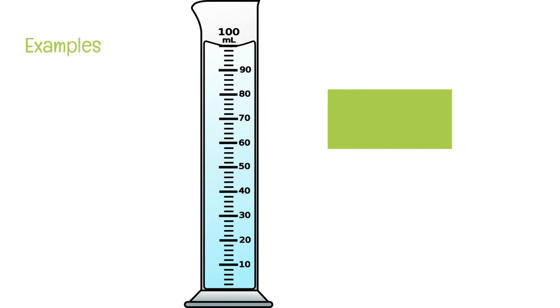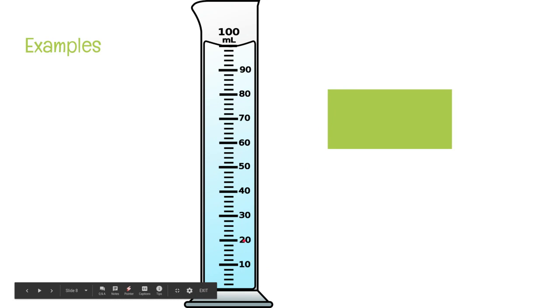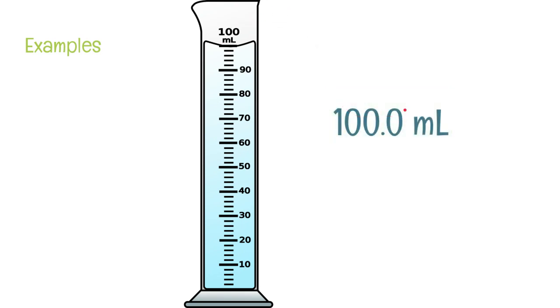So here's another example. We are going by tens here, which means that each one of these little lines is 2. So this would be 30, 32, 34, 36, 38, 40. The bottom of the curve is sitting on exactly 100, but we're not going to write 100 milliliters because 100 is what everybody in the room knows. You need to give one estimated digit. Because this is falling exactly on the line, your estimated digit is going to be 0. So this is 100.0. In real life, you may see 100.0, I may see 100.1. That's okay.